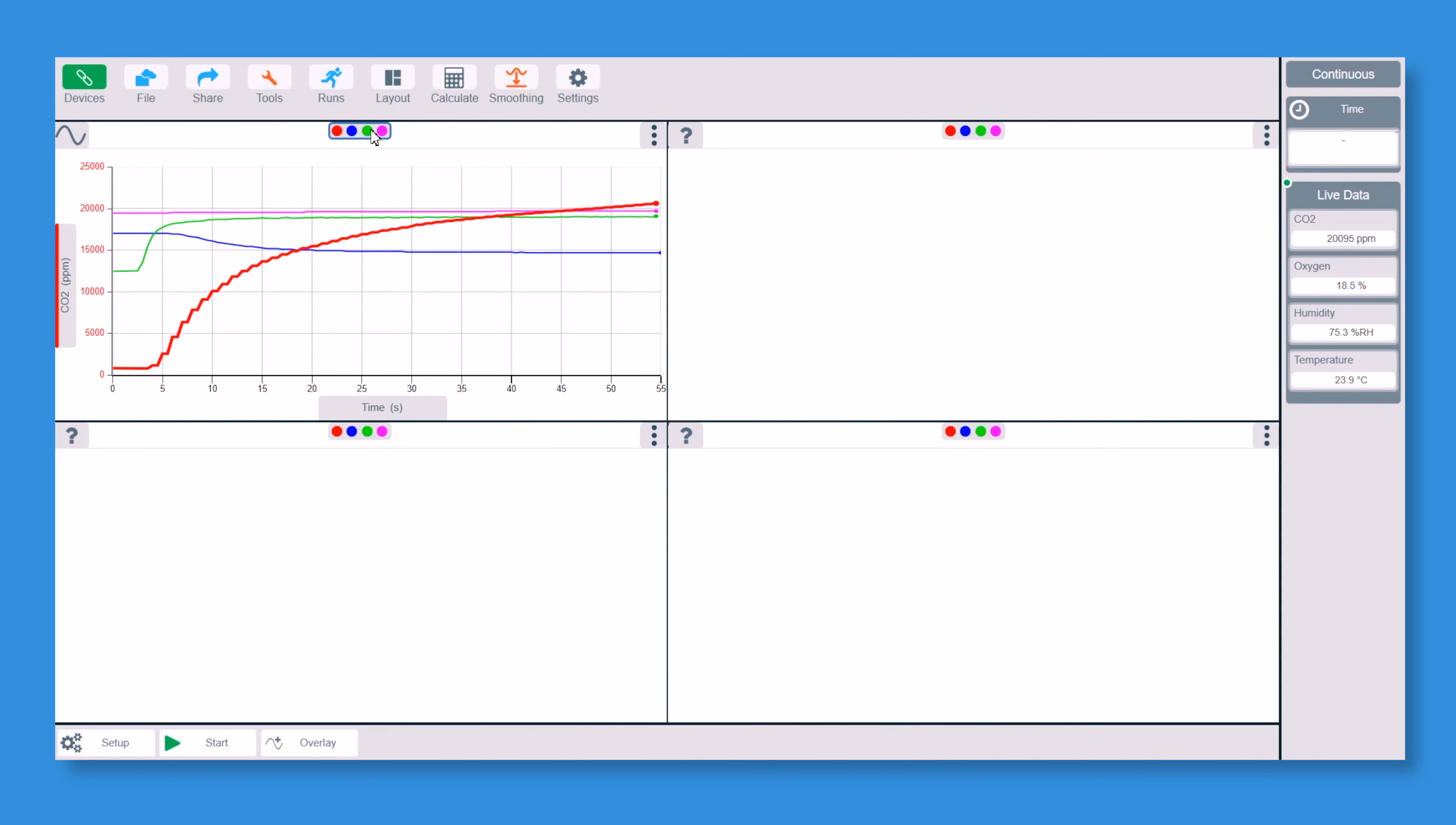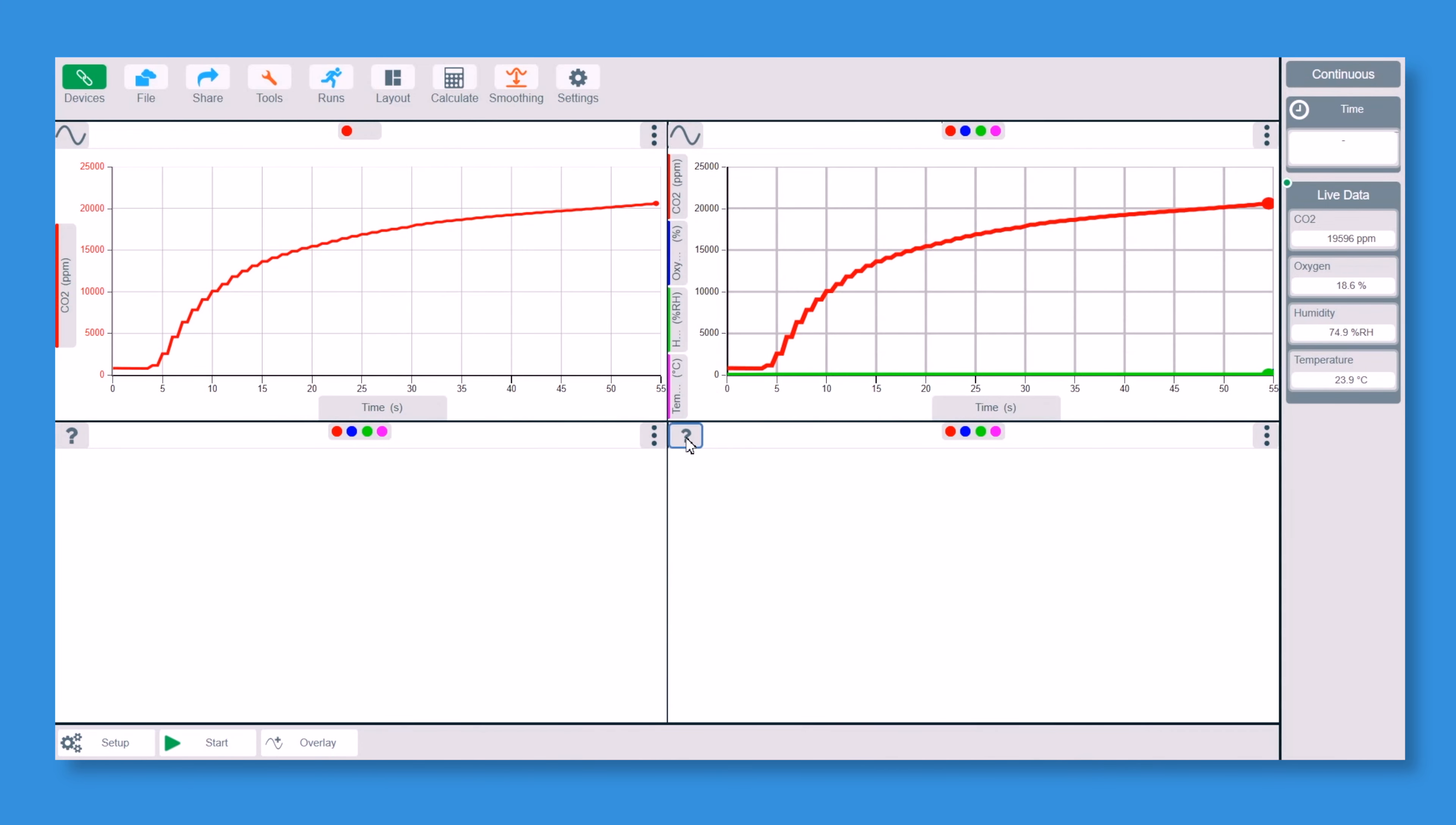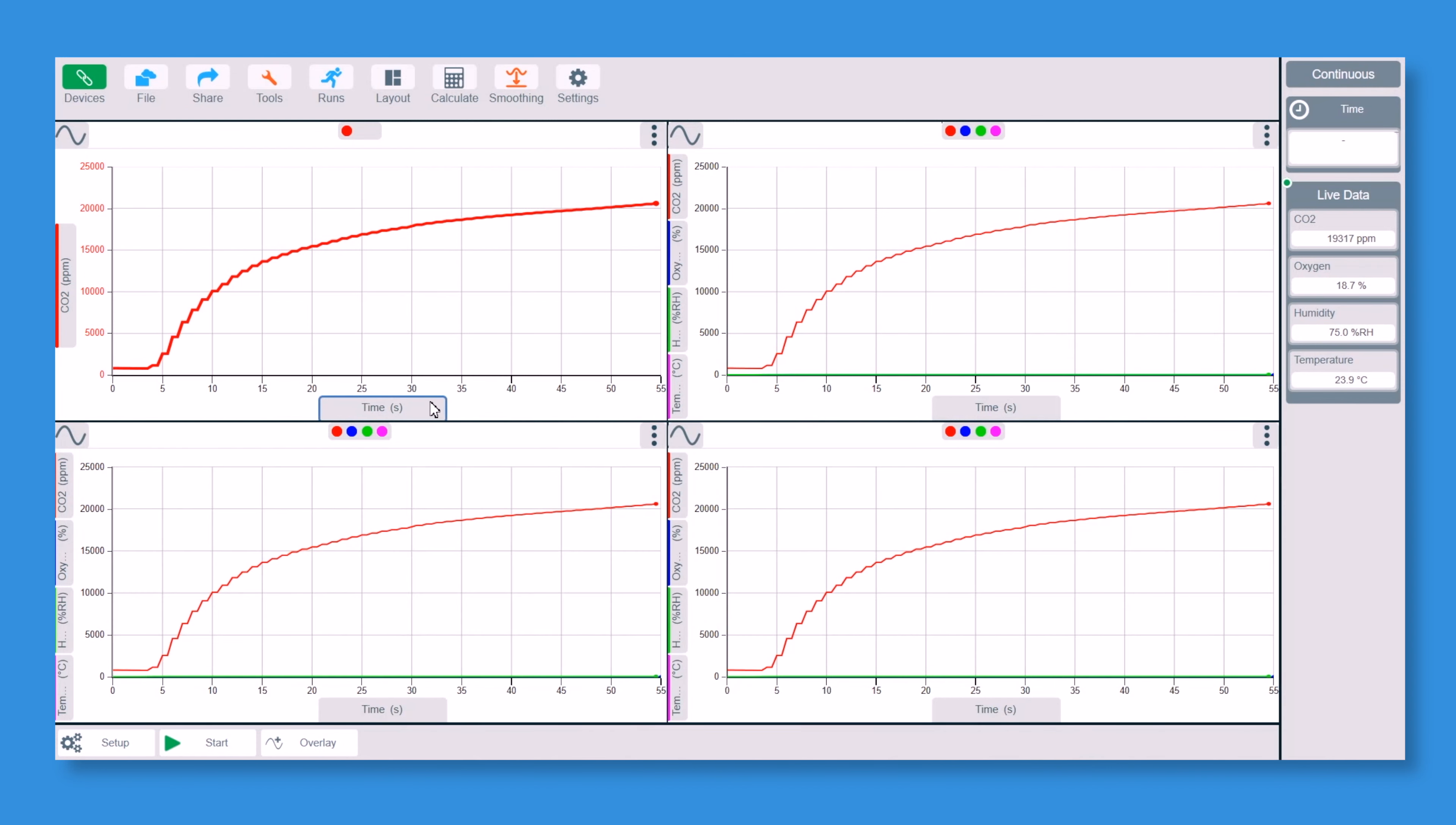On the first one, I'm only going to have CO2. On the second one, now I need to show them all as a line graph. Let me just go ahead in time and turn the line graph on on all of them. So we now have four line graphs showing up.